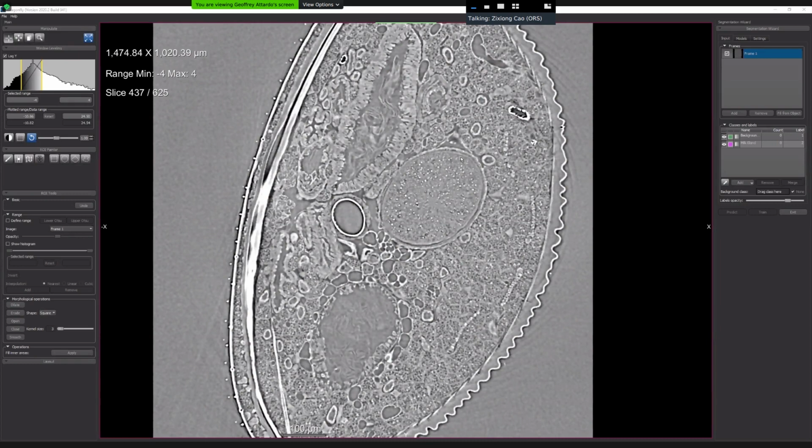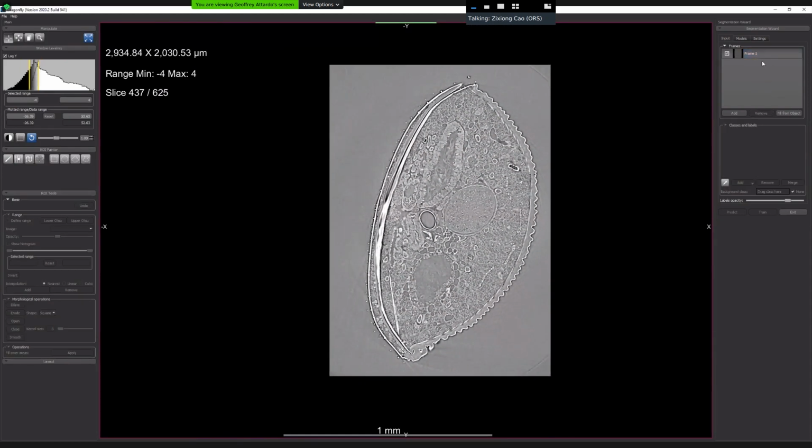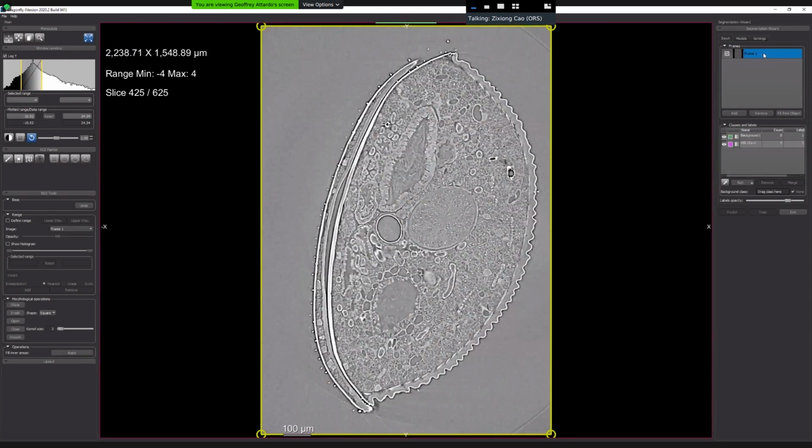Do I need to request the control again? Yeah, I tried doing that again. I think I don't see the frame. Oh, maybe it's not in the right slice. When it's not in the slice where the frame is created, you don't see the frame, but you can always click the frame to go back to that slice.